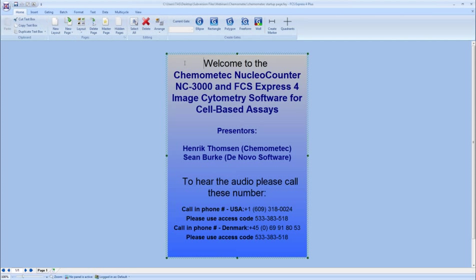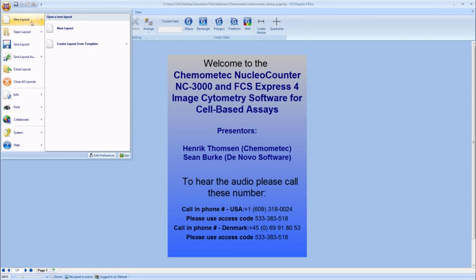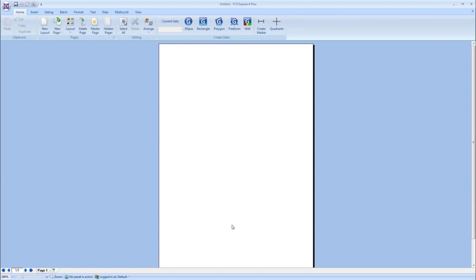So right now you see on the screen we have a welcome to the webinar screen here. But what I want you to notice is that we're actually in FCS Express right now. And if I come up to what we call our Applications button and insert a new layout, you'll notice that we have a blank page here. The whole idea behind FCS Express is that it looks and acts just like Microsoft PowerPoint or Microsoft Word or the Microsoft Office suite of products. So if you've ever used Microsoft Word or PowerPoint, which almost everybody has, you're going to be able to come into FCS Express and immediately be familiar with everything that we have to offer.